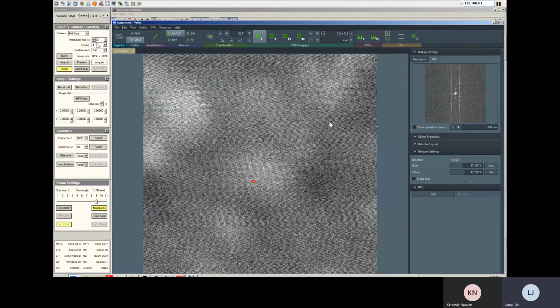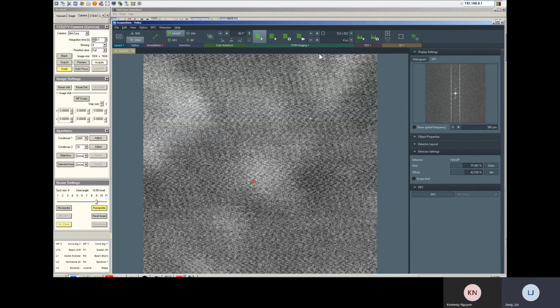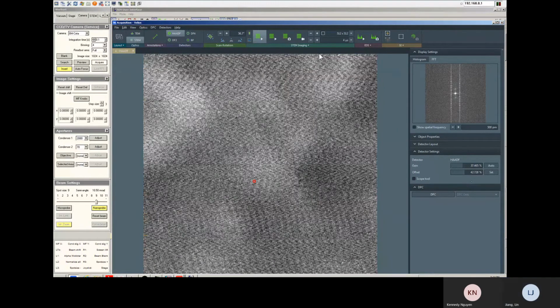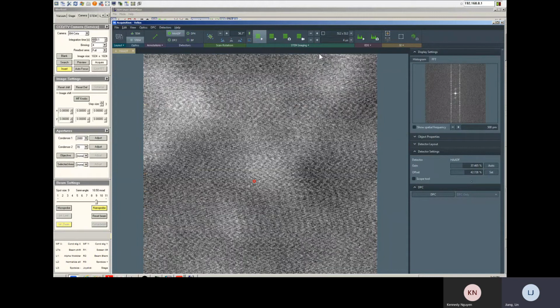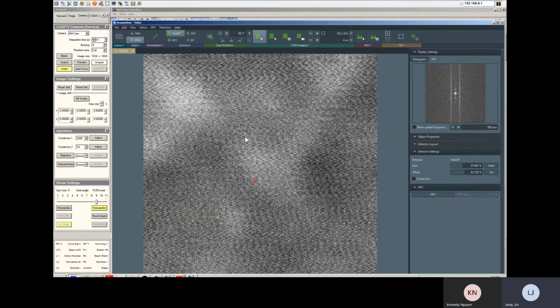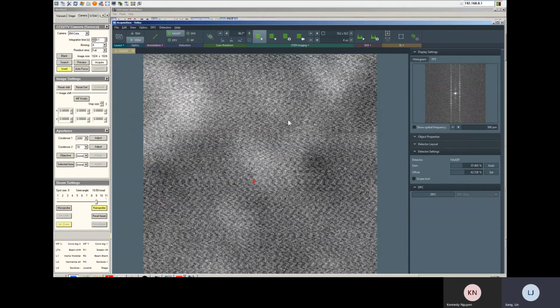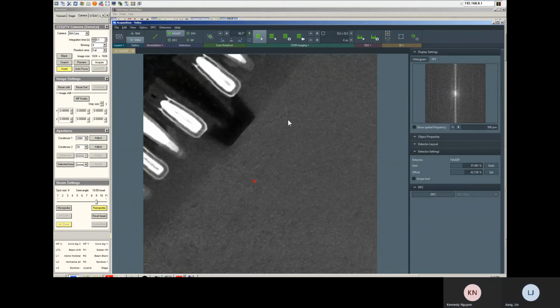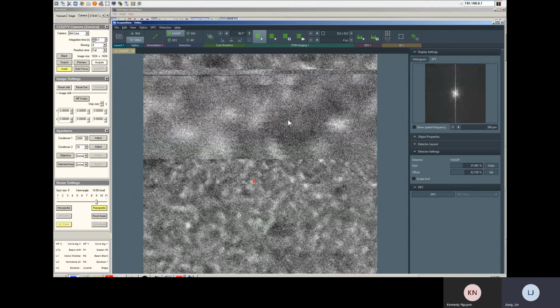You cannot get very high resolution imaging, because I know this is something like the highway maintenance close by. And Intel is close by. They have a new reconstruction building going on. So you see, it's working for now, because now it's good. You see, you can push. Let's wait a little bit.